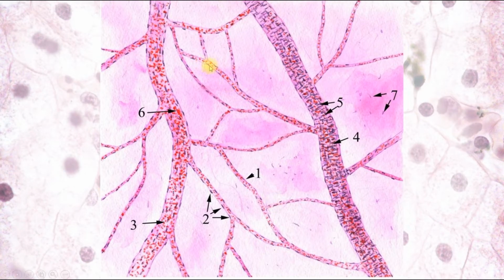And here we can see small capillaries, venule, arteriole, and in other blood vessels, and they have endothelial lining. And we can see nuclei of endothelial cells here, and capillaries, they have this thickness of endothelial cells and basement membrane, and some capillaries haven't any other structures.